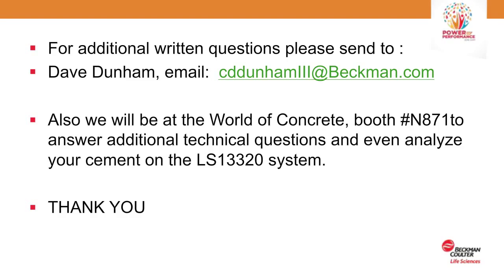That's great. Our next question, Miguel asks, what is the life of the sensor? Typically, these are solid state lasers, so depending on its use, if you're operational 24 hours a day, you're probably talking 8 to 10 years.